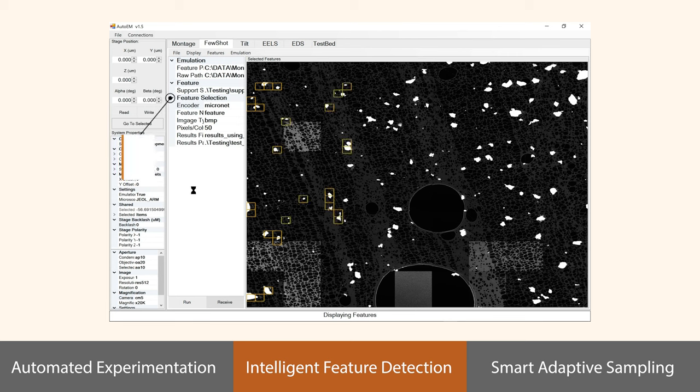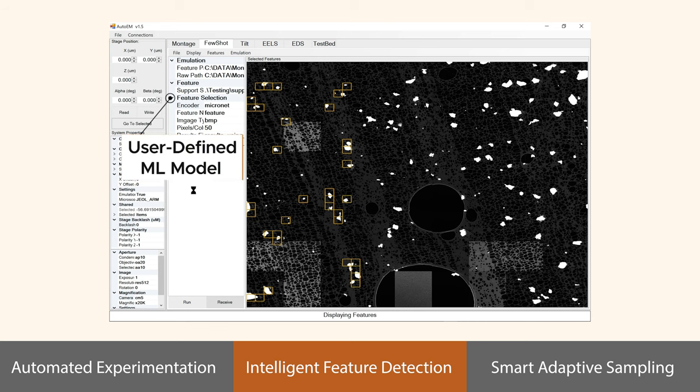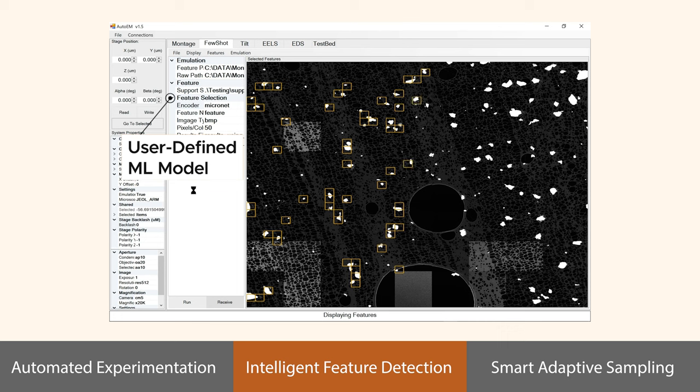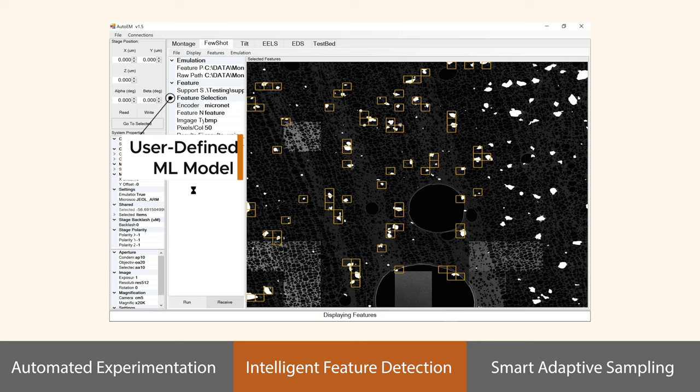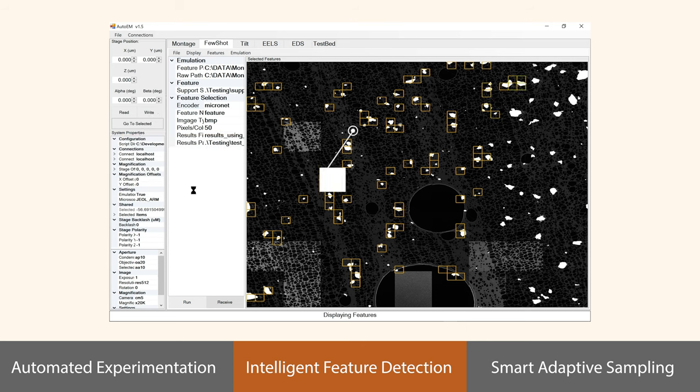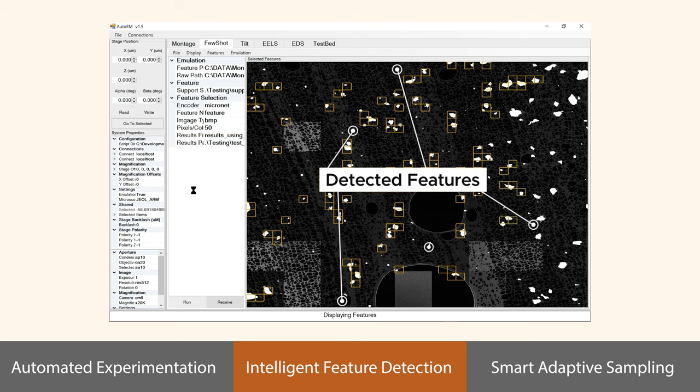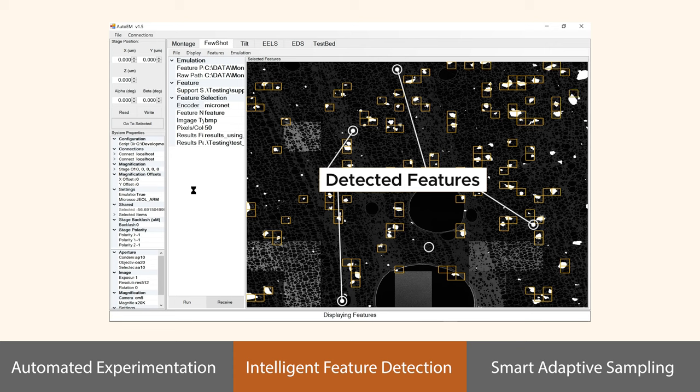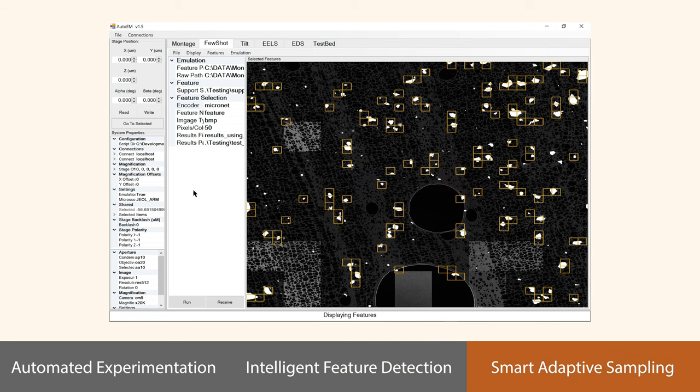The user can then define objects of interest for more detailed examination. In a matter of seconds, the user can train a sophisticated few-shot machine learning engine using just a handful of examples. The system then automatically searches for these features, pinpointing their location and measuring statistics over a large, representative region. This information can rapidly highlight defects or interesting sample features for further analysis.